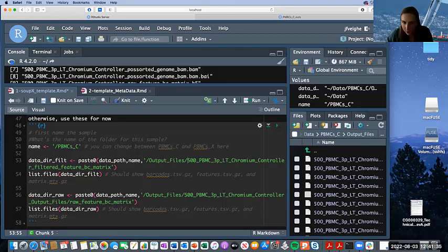I just have to think of where I am right now. It's probably easier to do it on the terminal. Yeah, I would just do it on the actual terminal. I might just do echo path. Okay. I like Alejandro's solution too. You can also just untar the PBMC folder, but I'll put this in for those that want to copy as well.